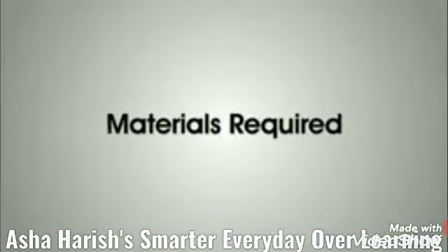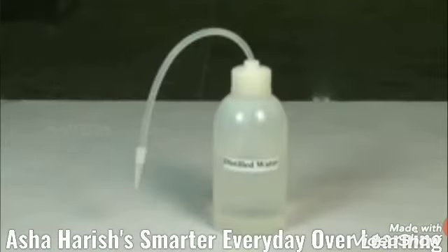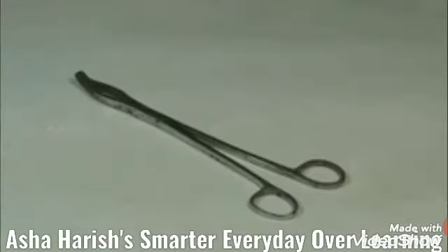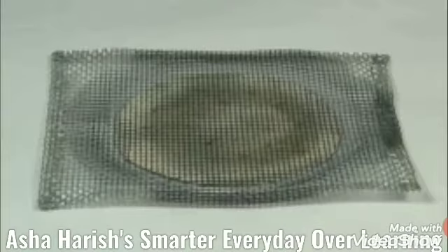And what are the materials required to do this activity? Metallic sodium, distilled water, organic compound, forceps, test tube stand, tongs, funnel, filter paper, wire gauze, tripod stand, and Bunsen burner. Right, now let's see the procedure.